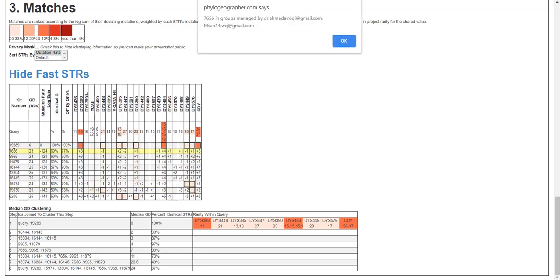If you click on one of your matches, it tells you the name and the email address of the person that manages that group so you can contact them.